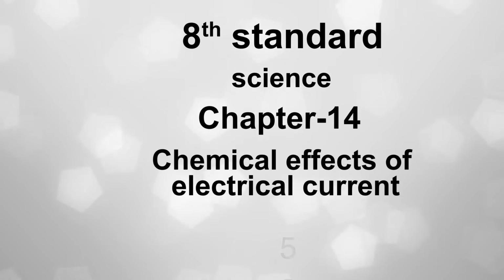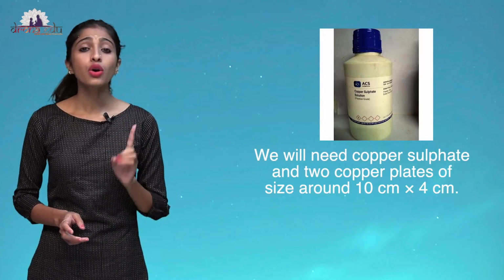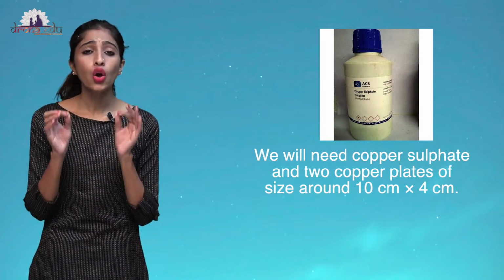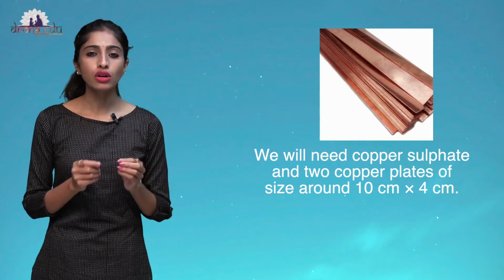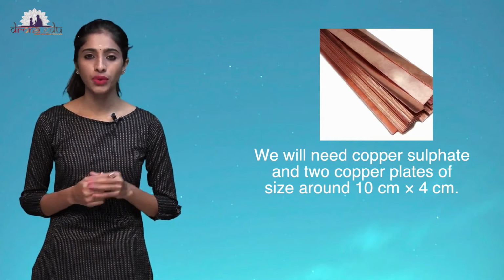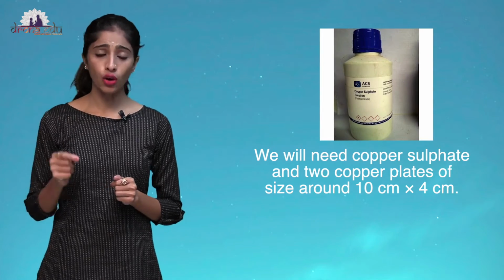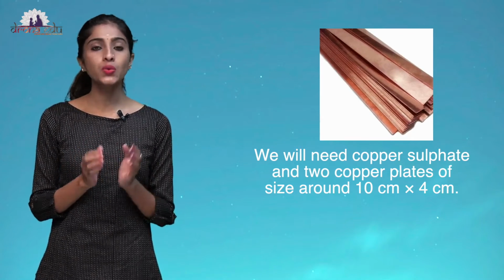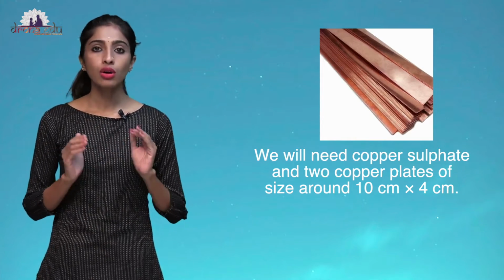In this class, I am going to teach 8th standard science chapter 14, chemical effects of electric current. For this experiment, we will need a copper sulphate solution and copper plates, copper strips, around 10 centimeter into 4 centimeter in length and breadth. We have both of them.